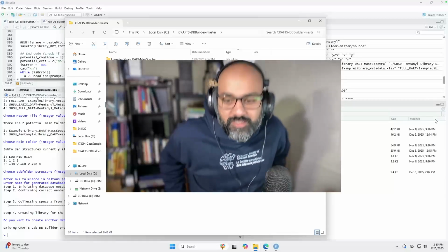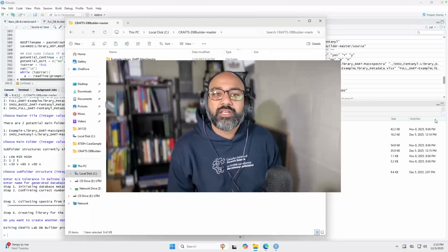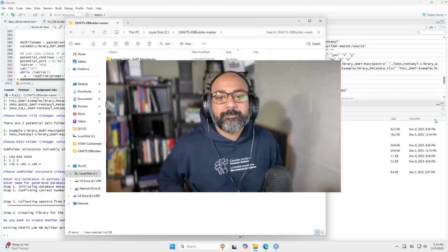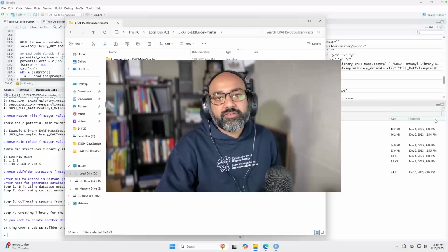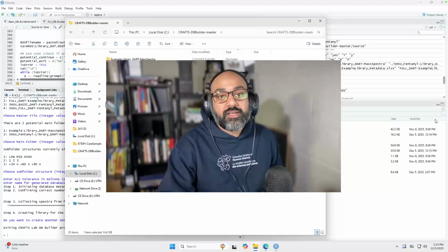Hey everyone, this is a follow-up to a previous tutorial where I showed you how to build your own databases to use with the NIST NIJ DIT. In this video, I'll show you how to include your databases in the DIT, and then use them as you need.